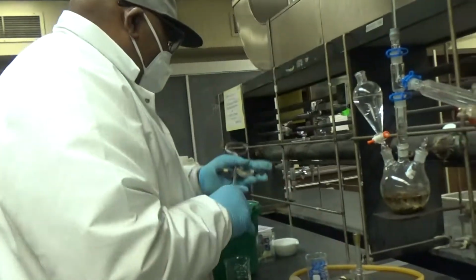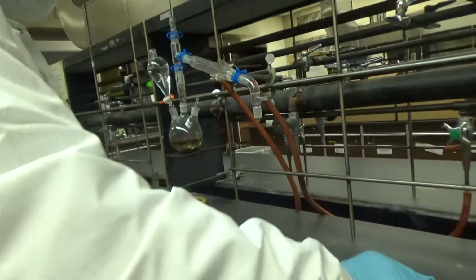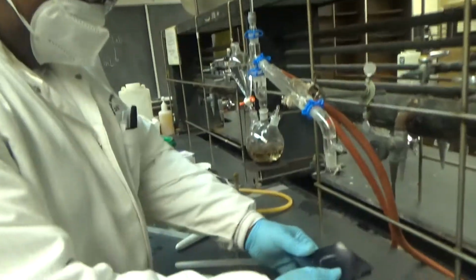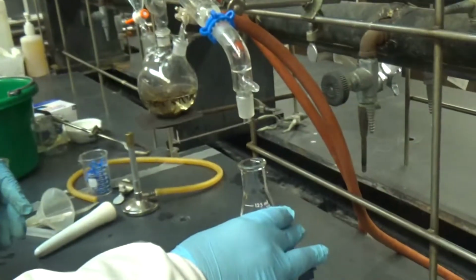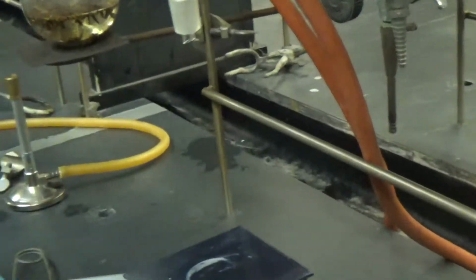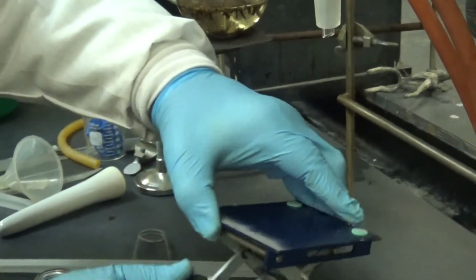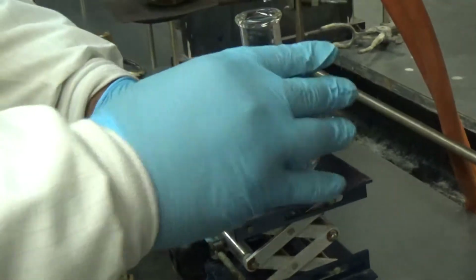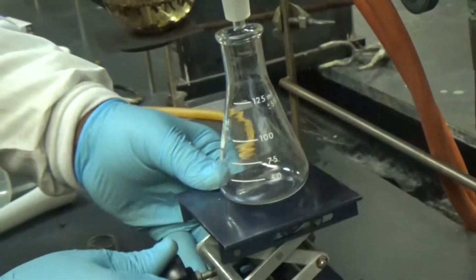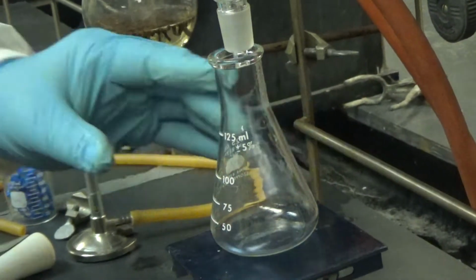Okay. So now, you need a 125 milliliter flask, which you put here, and you can see it doesn't have a top, but that's not a problem. You just need to use the jack, bring the jack up. So that's a 125 milliliter Erlenmeyer flask to capture the material as it distills over.